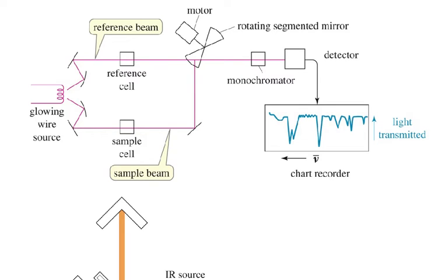And I know it looks intimidating, and I would suggest you get used to looking at these diagrams and not getting intimidated. If you're taking organic chemistry as a biology or pre-medical major and you're going to take the MCAT, the ChemPhys section is full of stuff like this, where they give you a bunch of boxes and make a diagram of some analytical machine in chemistry or physics or physical chemistry.